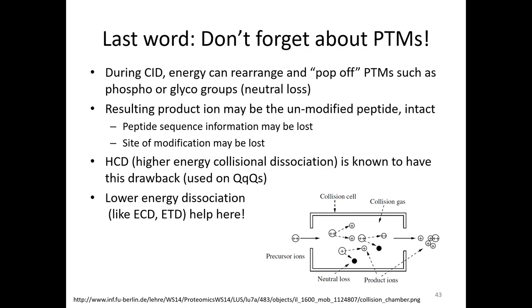All right. So post-translational modifications are something that are often lost when you do fragmentation. I mentioned this earlier. If they are an important aspect to you, whether that they're present or their particular location in the sequence, then the triple quad may not be the best instrument for you. Especially not unless you have an exact internal standard.